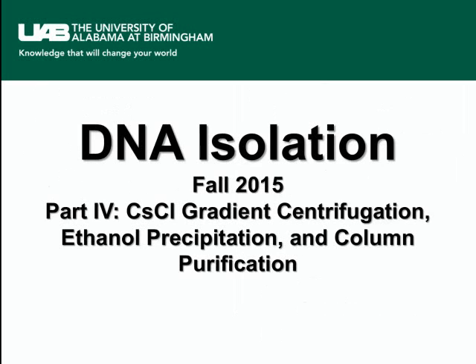The next lecture is part 4, and we're going to talk about what you do to purify the DNA now that you have neutralized the lysate and extracted with the phenol chloroform isoamyl alcohol.